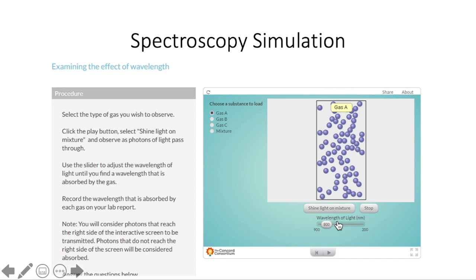So you can adjust both of those things with this simulation. When you do this online, this left side tells you the procedure. And if you scroll down on the left side, it has the questions where you can answer those questions to generate your report. You'll want to do this together with your lab partner so that you can talk about all of the things that you're seeing in the simulation and come to a consensus about what you think the correct answers are.